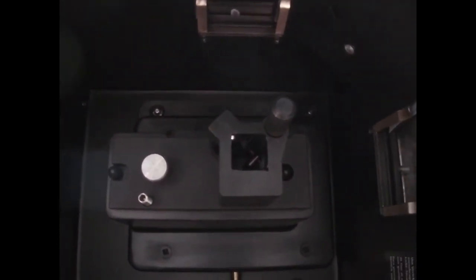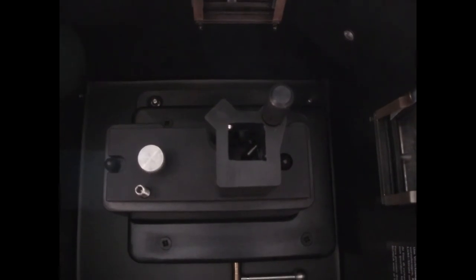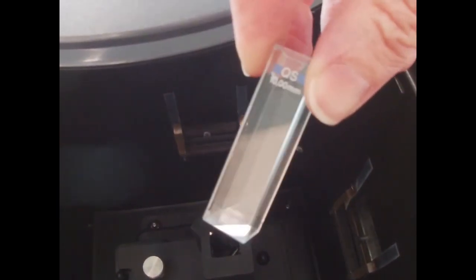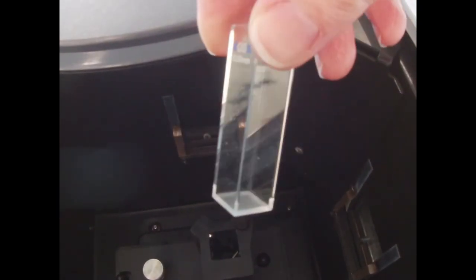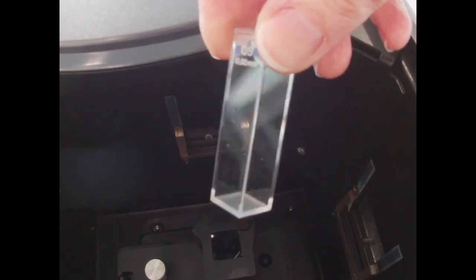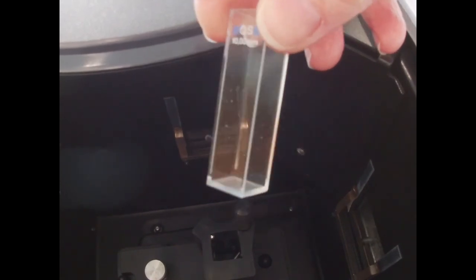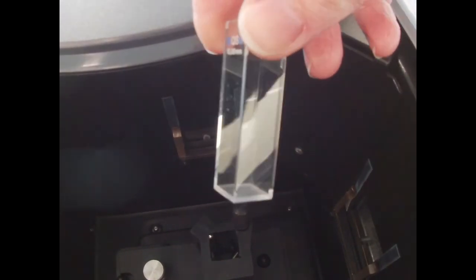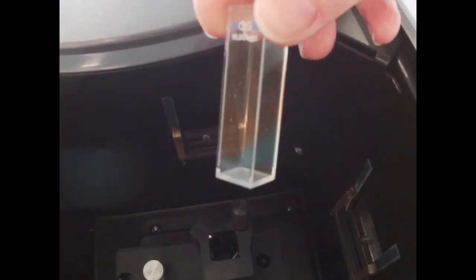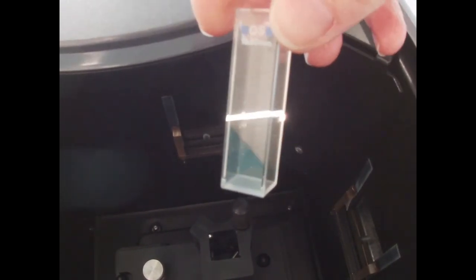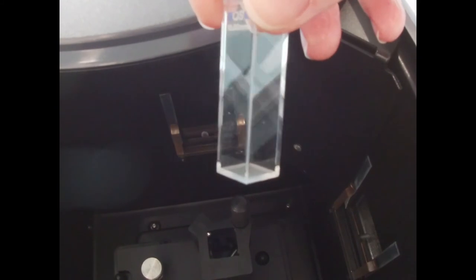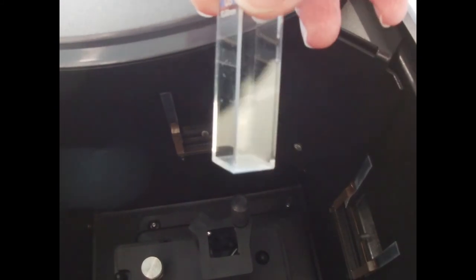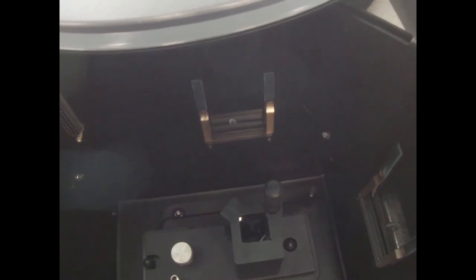we use four-sided transparent quartz sample cells. They're one centimeter in diameter, so we have a consistent path length across the sample, and they're optically transparent in both the UV and the visible range.